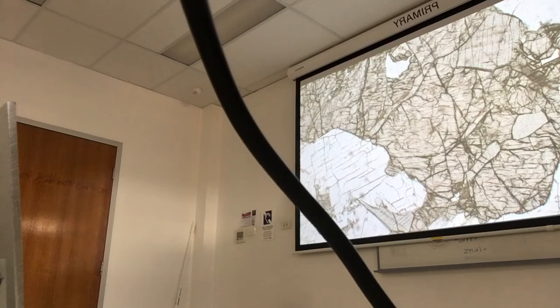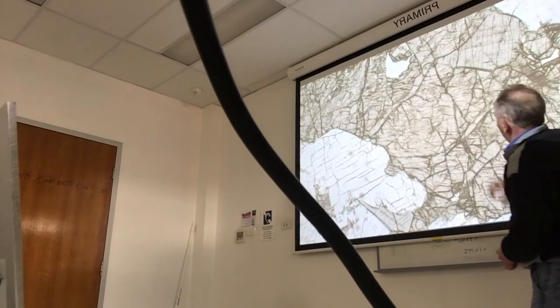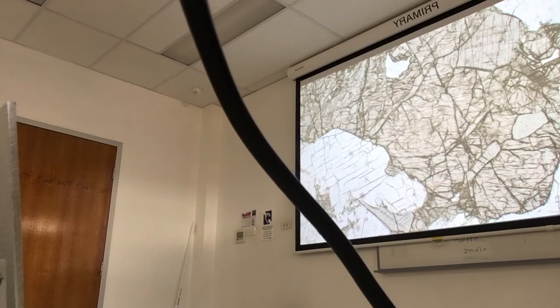And if you think about that, because these are quite large lamellae, they're probably making up 10% or more of that grain, and their composition's up here, the host is down here. If you think about the composition of the grain as a whole before it exsolved, it's pigeonite. Okay, so that's exsolved pigeonite. What we looked at before was exsolved subcalcic augite. You'll hear the textbooks call that inverted pigeonite, which makes absolutely no sense whatsoever to me. It hasn't been turned upside down, it's exsolved. So it's exsolved pigeonite.